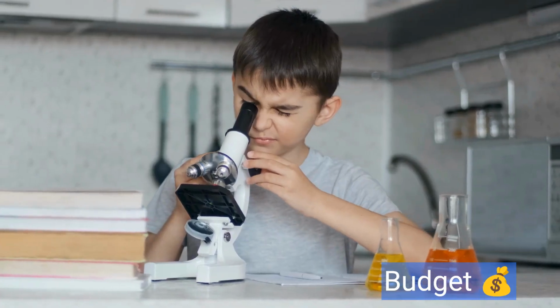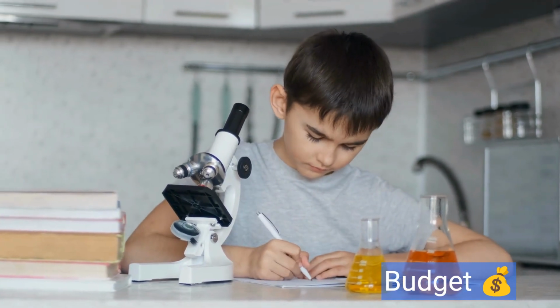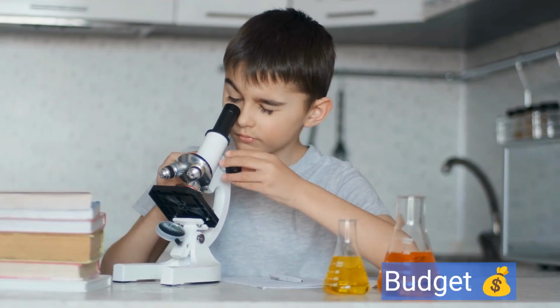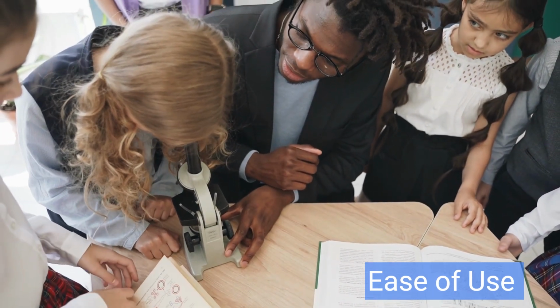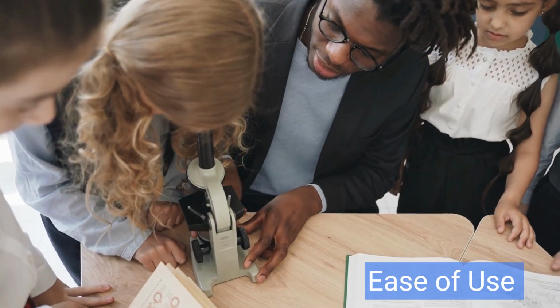Step 8. Budget. Determine your budget and look for microscopes within that range. Keep in mind that quality and features often correlate with price. Step 9. Ease of use. Choose a microscope with user-friendly controls and adjustments. If you're a student, an easy-to-use microscope will be beneficial.